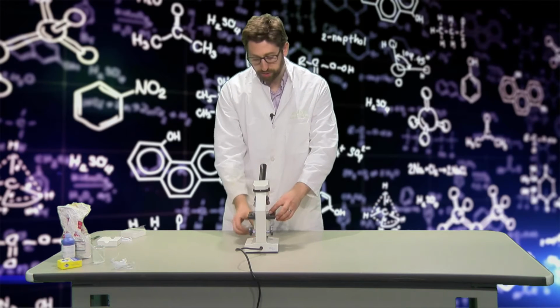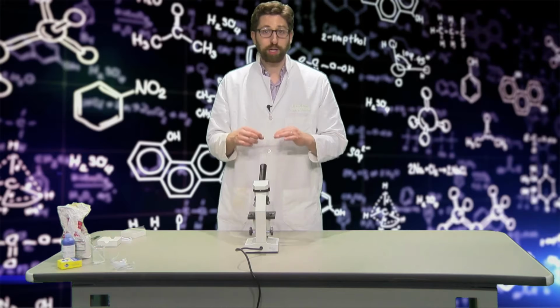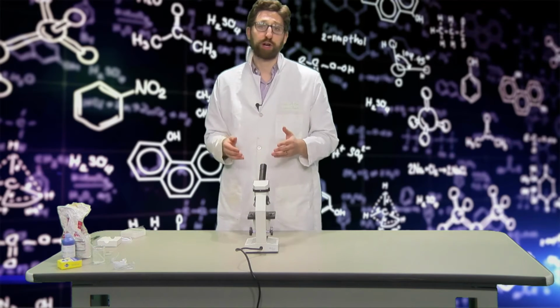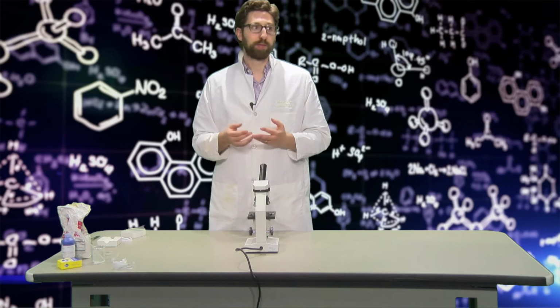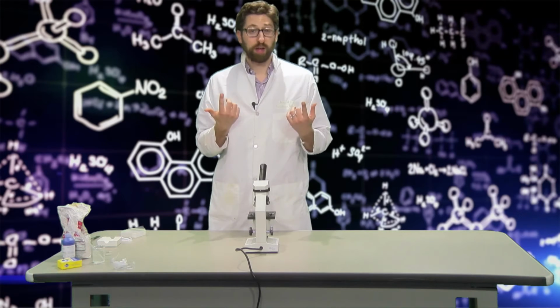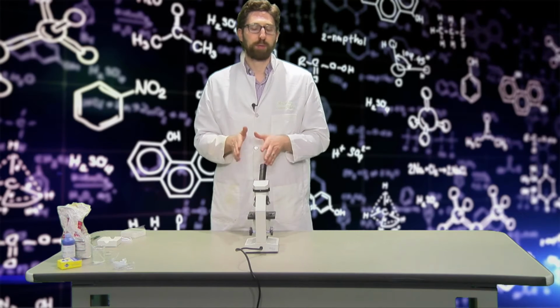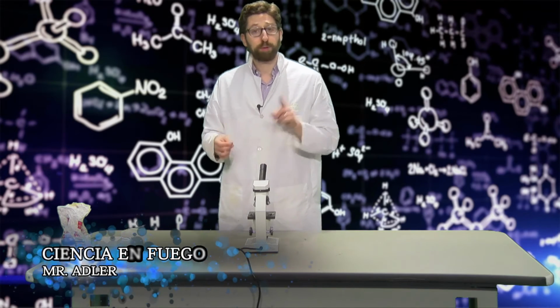I'm going to turn off my microscope for a minute, unclip my slide, and now that I've seen something non-living, my sugar, I want to take a look at something living, me. Now, I won't fit on this microscope stage unless I want to break it, and I definitely don't want to break my microscope, but I can take a sample of my cheek.